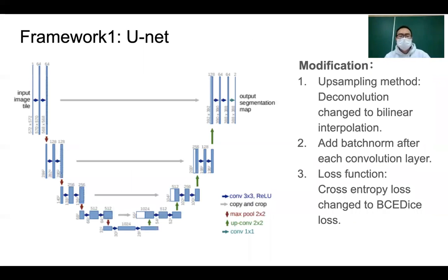We chose to use the UNet architecture because it is the most common architecture for biomedical image segmentation. The downsampling part is similar to a CNN, with convolution and max pooling, but the up part is just interpolation, which doesn't require any more parameters, and we use concatenation between the down part and the up-sampling part so that information communicates throughout. We take the input image, scale it down in dimension and raise it up, so at the end we have the same dimension as our input, and we implement a softmax function at the end too.